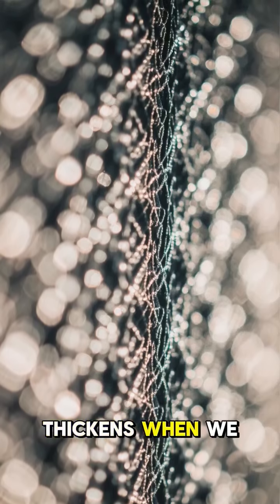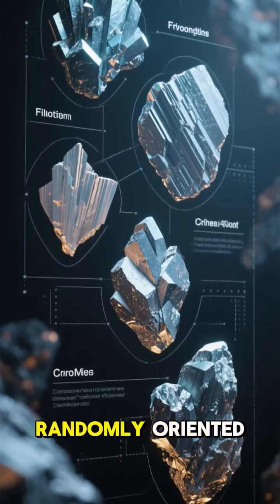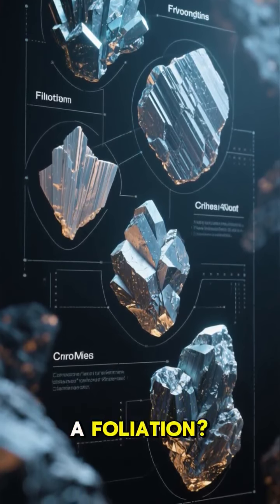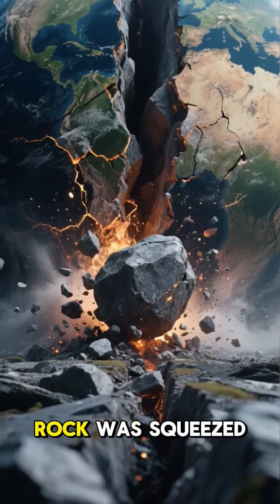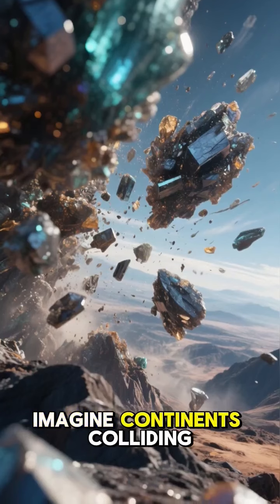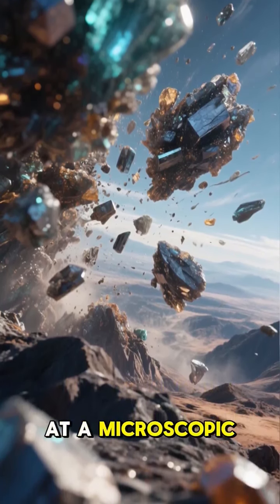But the plot thickens when we look at the textures. How are the minerals arranged? Are the grains randomly oriented, or do they show a preferred alignment, a foliation? This alignment screams deformation. It tells us the rock was squeezed and sheared under immense tectonic forces. Imagine continents colliding, and you're seeing the evidence right there, at a microscopic scale.